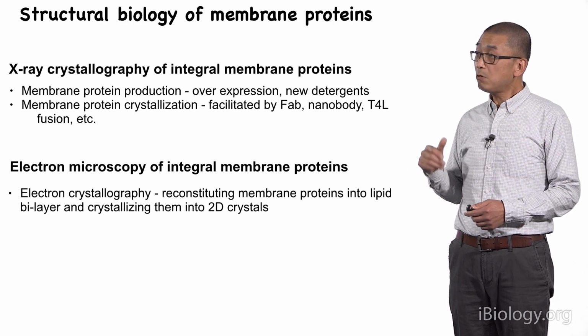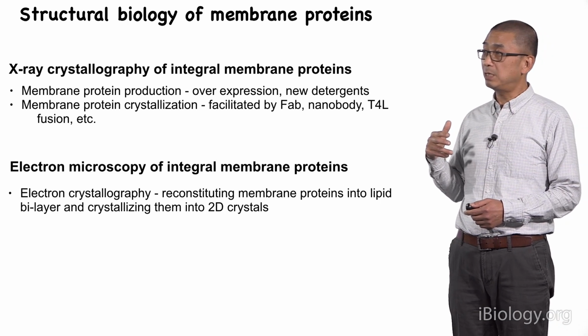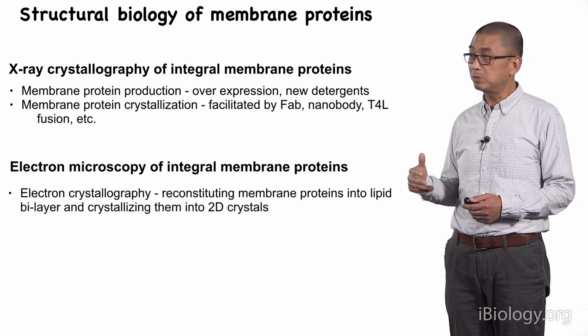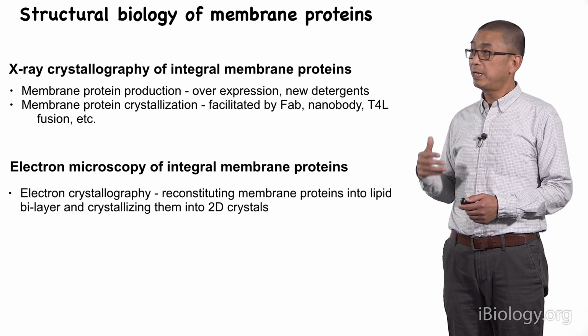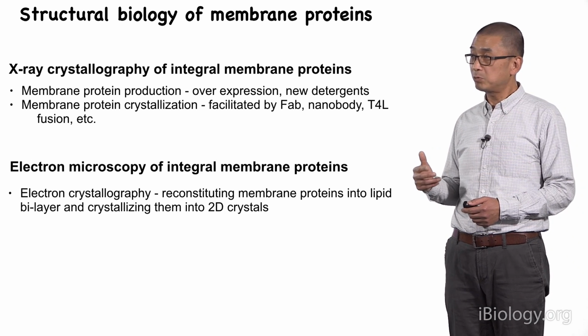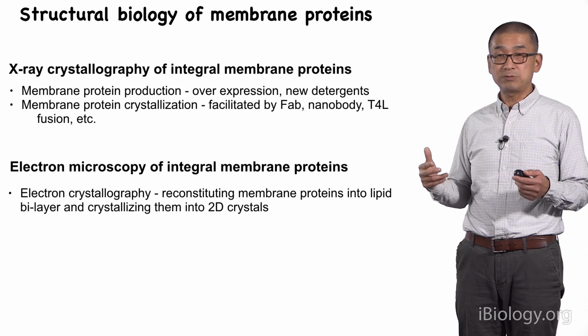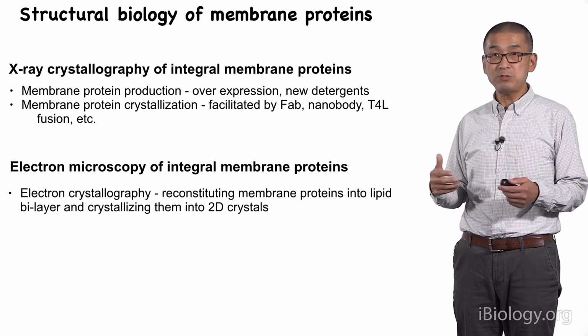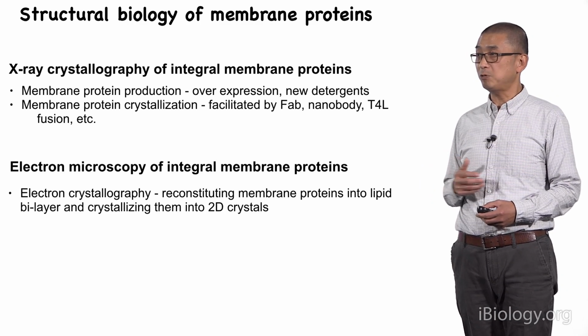Cryo-EM, as I mentioned earlier, has also been used to study membrane proteins, particularly in the early days when electron crystallography was able to determine membrane protein structures to atomic resolution. In this case, the membrane protein was crystallized into a two-dimensional crystal, still using a crystallographic approach.